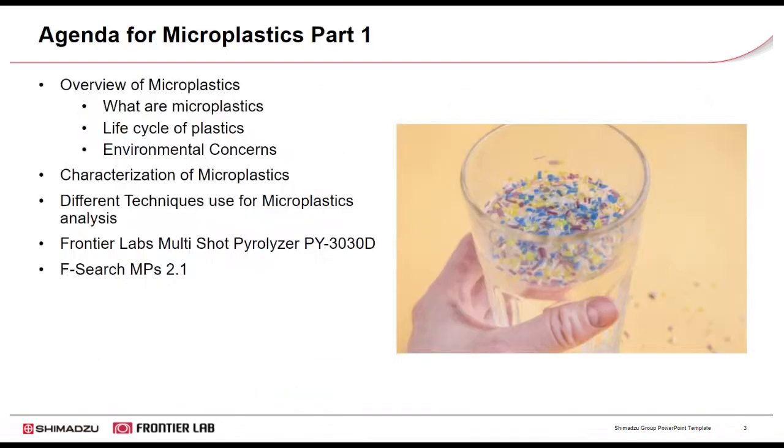We have a lot of information to share with you during today's webinar. First, we will take a look at the general overview of microplastics. I'm sure most people in attendance of today's webinar are familiar, if not authorities, on the subject matter, but we would like to take the time to discuss exactly what microplastics are. We will also highlight what makes microplastics as a whole innately difficult to characterize, measure, and/or quantify, and why these difficult analytes are alarming in terms of an environmental concern.